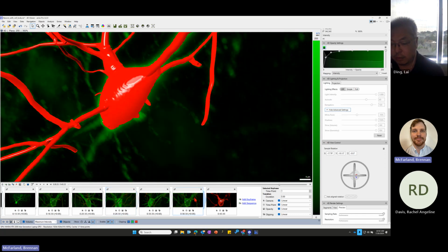So kind of think of this like, if you remember within our analysis panel, for each one of the operators, they had those eyeballs where you can show what the result would be before you run it. This is kind of the same idea. We're not actually implementing the rendering, we're just building it. So this is not exactly what it's going to look like if we were to export and create the movie.